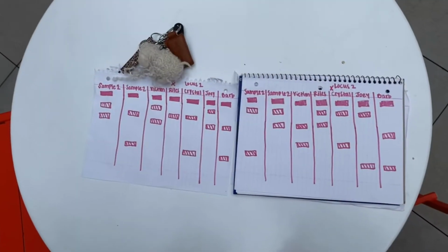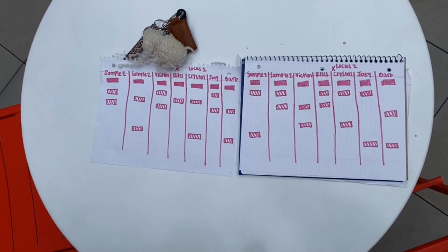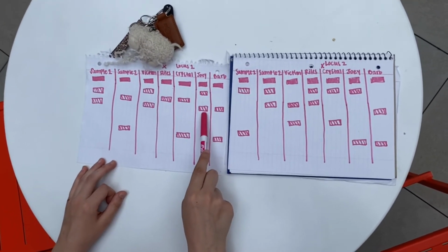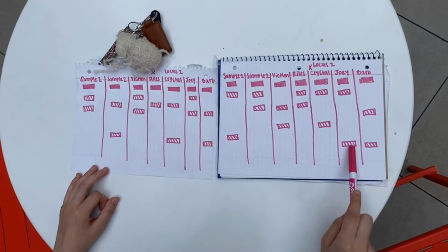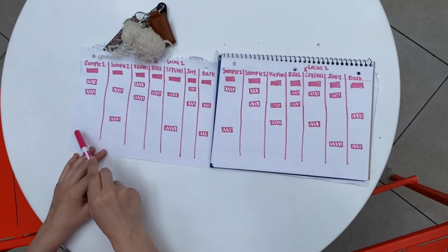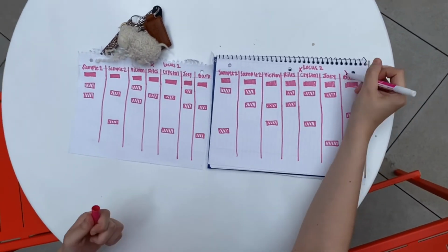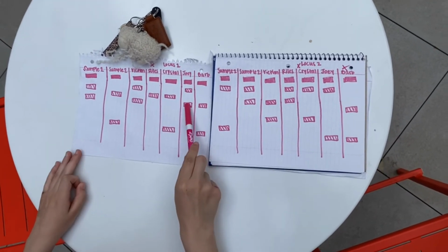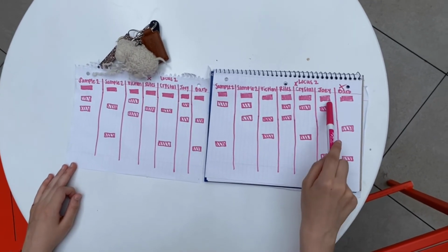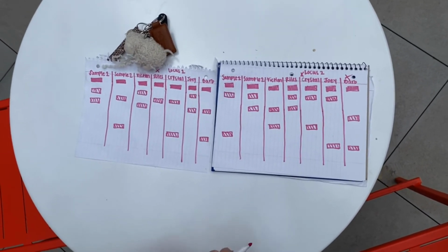Now we're going to see if Joey and his mom Barb are suspects. We know Barb is Joey's mother because one allele is donated from the father and one is donated from the mother. We can see on locus 1, Barb donated this allele to Joey, and on locus 2, she donated this allele to Joey. However, her DNA bands do not match sample 1 or 2 of the hair, so she cannot be guilty, which means we need to look at Joey. His hair sample matches sample 1 on locus 1, so then we go to locus 2 and see his hair sample matches sample 1, which in conclusion means sample 1 hair belongs to Joey.